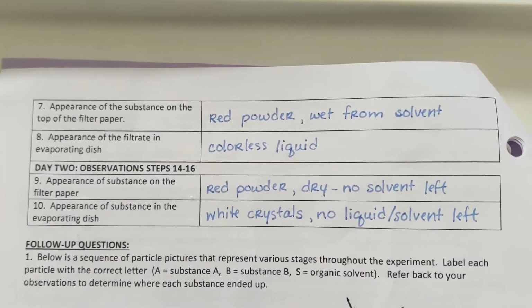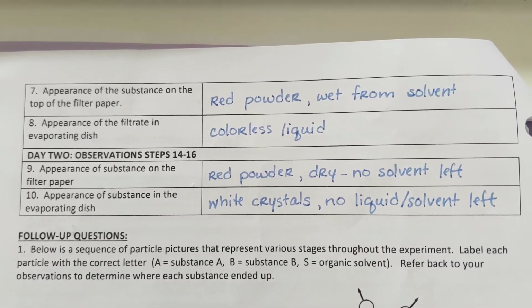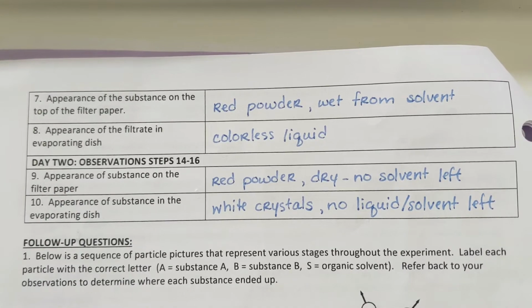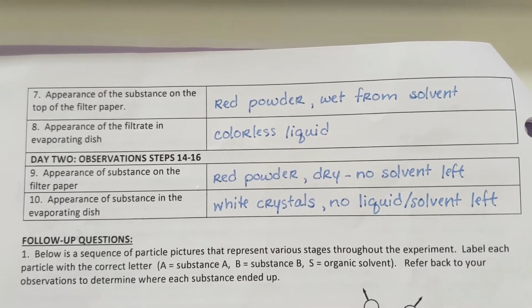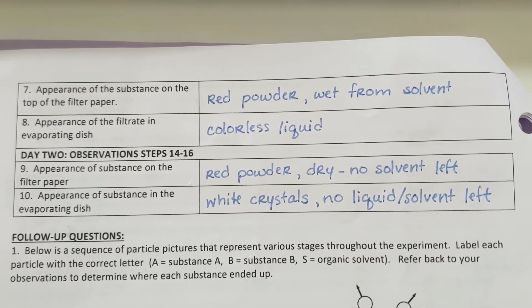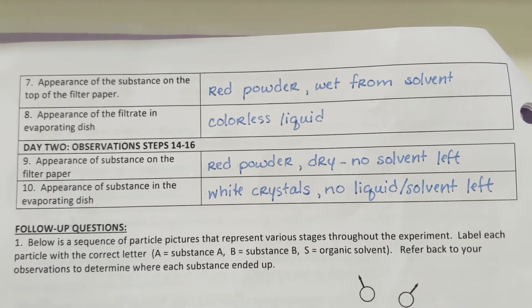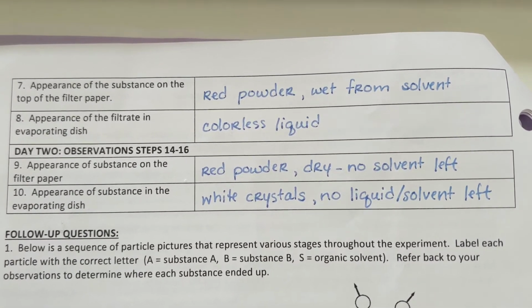We also took some data on day 1 and saw that when we finished filtering, the red powder was separated from the white mixture. It was on top of our filter paper, and we couldn't see substance A anymore, but since it's dissolved in the solvent, which was actually an organic solvent, not water, it passes through the filter paper and goes into the evaporating dish. And that liquid mixture that we had in the evaporating dish, we call a filtrate. It was a colorless liquid.